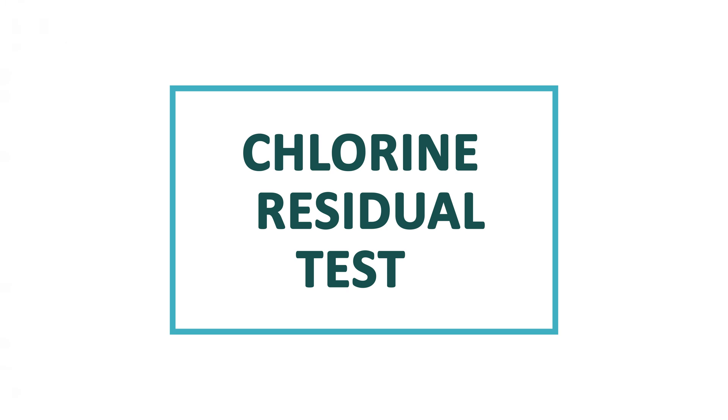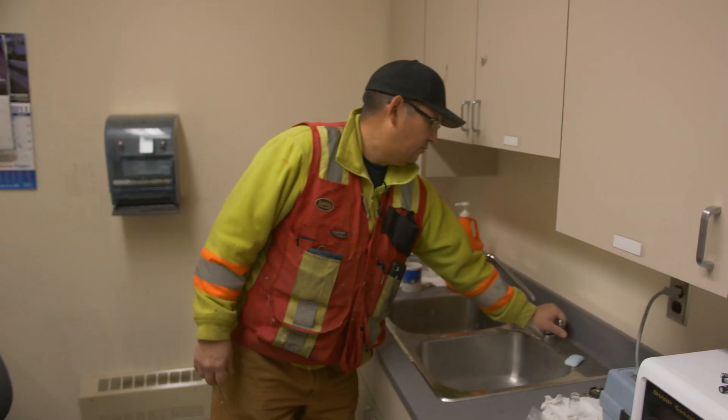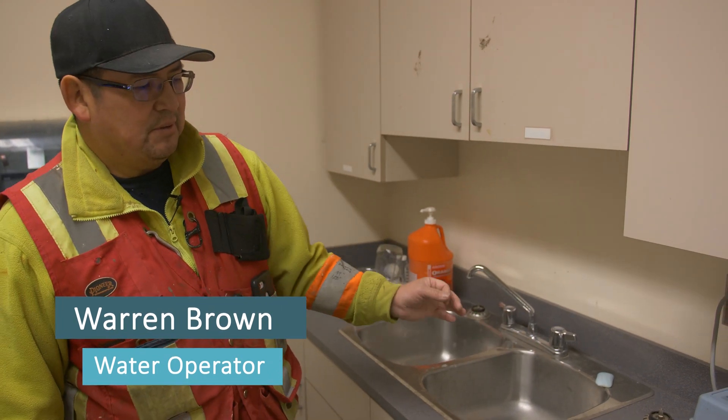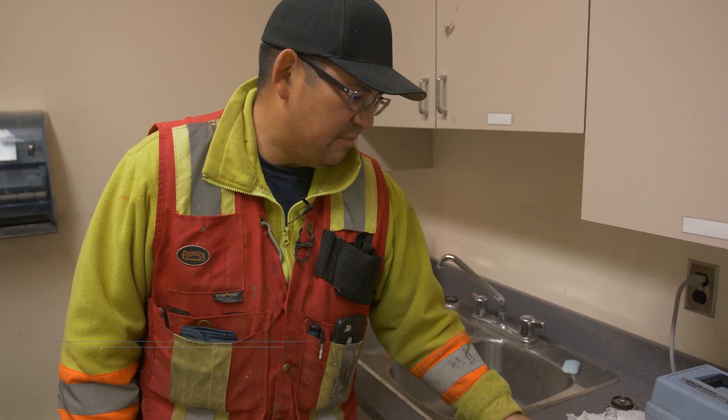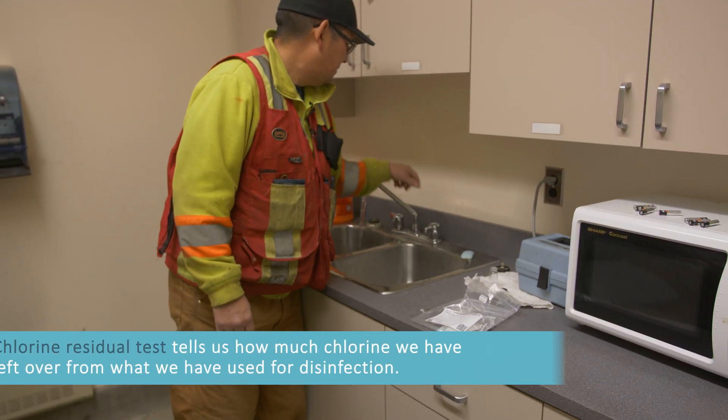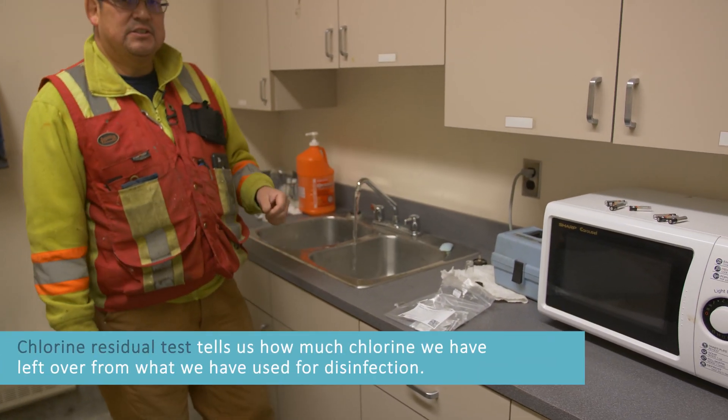Here we would do a chlorine residual test. We just run the tap for a while, take a grab sample, add the packet, and we're looking for a pink color. I'll just give a demonstration on it.